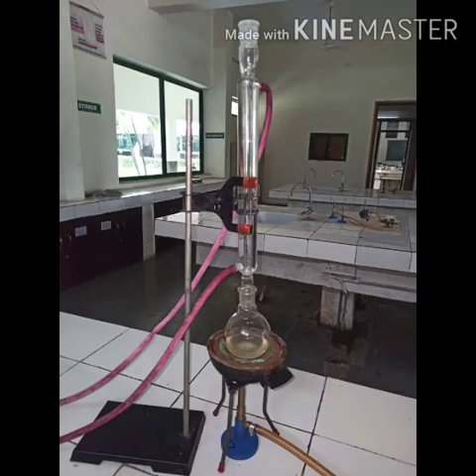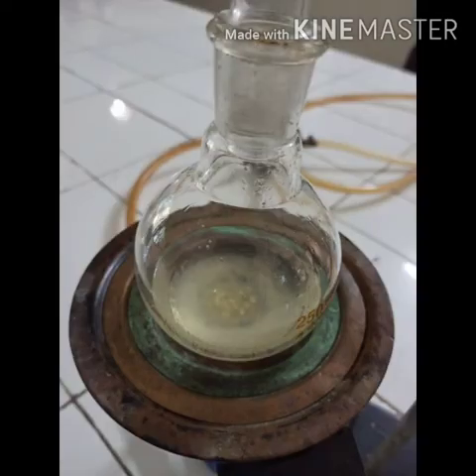After the addition, a reflux assembly was set up with the oil bath at 110 degrees Celsius. The reflux assembly was refluxed for 7 hours. The dry solid was separated out after the reflux.